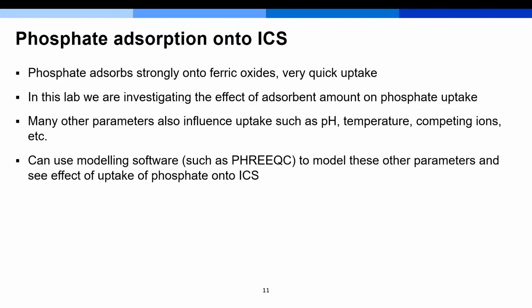But there are many other factors that can influence the uptake efficiency. Today, we'll just be investigating the effect of the amount of the absorbent on the uptake of phosphate. But there are other parameters such as temperature, pH, which is a really big one, contact time of the phosphate with the sand, interfering species, so competitive ions, and the particle size of the absorbent, which can influence the uptake.